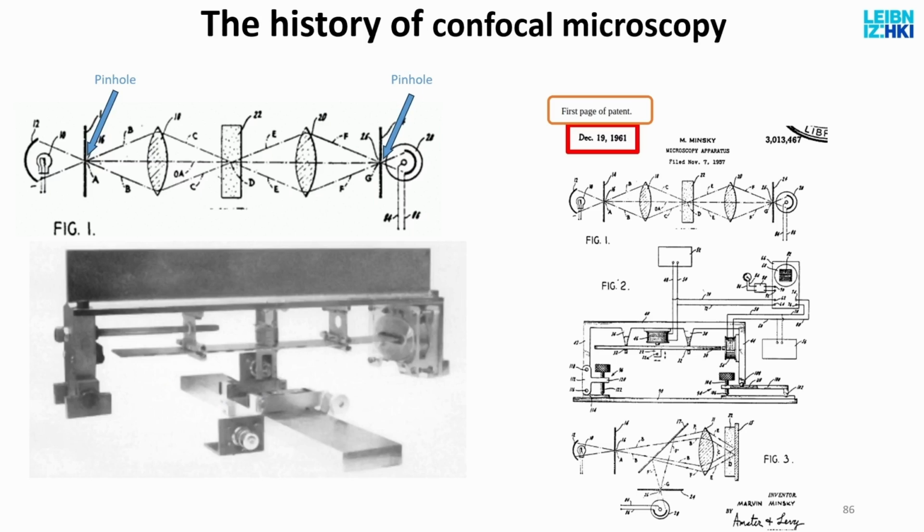Just a little bit of theory. So confocal microscopes have existed since the mid-50s. That's the first time when Minsky thought about this, and he built his prototype at MIT, Massachusetts Institute of Technology, which looked like that. And he already discovered the principle that you need a pinhole to do optical slicing. And Minsky loved to invent things and then never did anything with them.